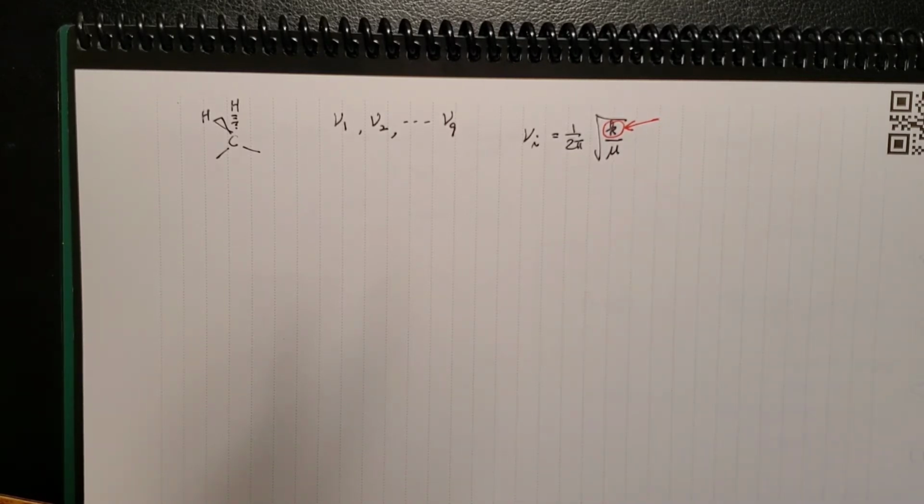Then the frequency of the vibration will be slightly different. Therefore, if you keep track of this signal, you can tell whether the CH2, including the drug, is free or bound.